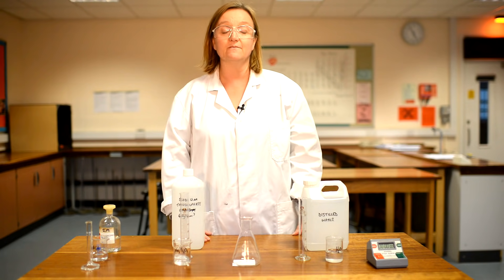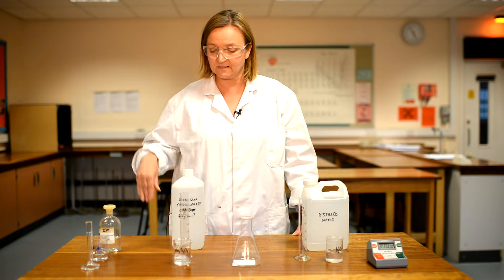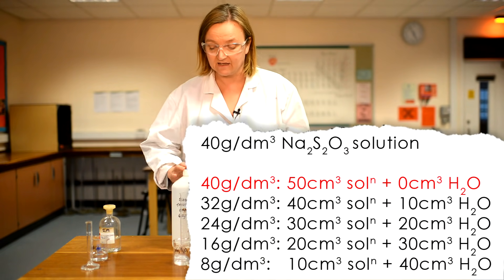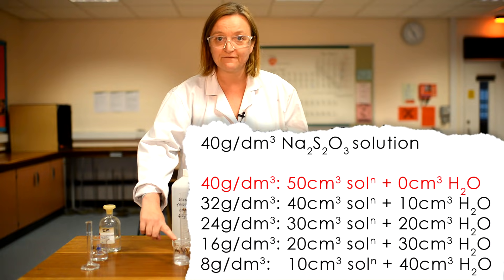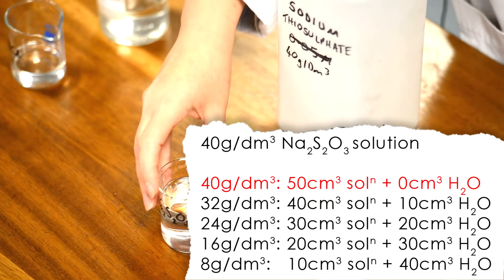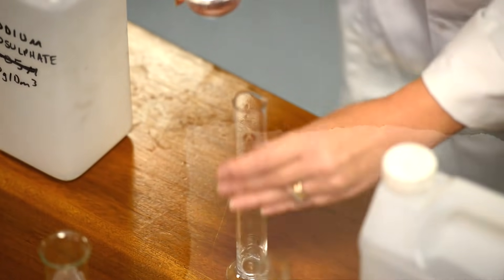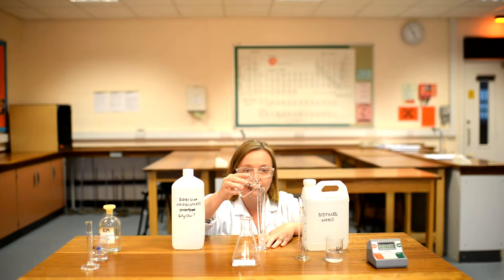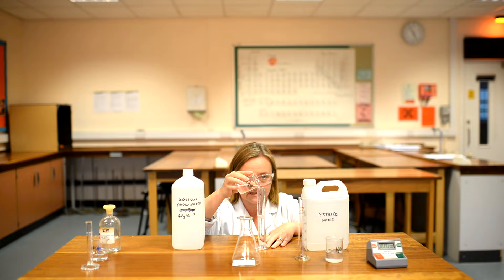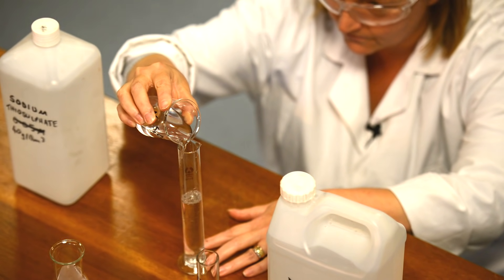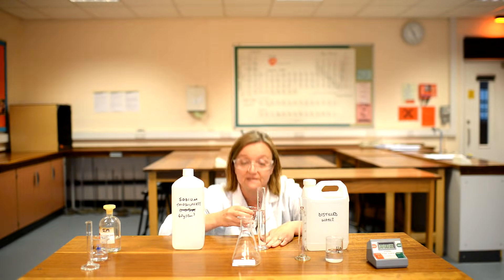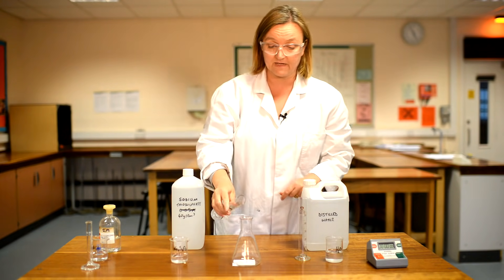To start with I'm going to use the most concentrated sodium thiosulfate, which is 40 grams per decimetre cubed as it comes out of the container. I'm going to measure out 50 centimetres cubed into my measuring cylinder, getting down to eye level so I can see the level accurately, filling up almost to the mark and then a little bit more until I've got exactly 50 centimetres cubed, then pouring that into the beaker.